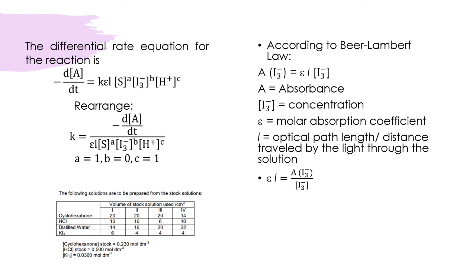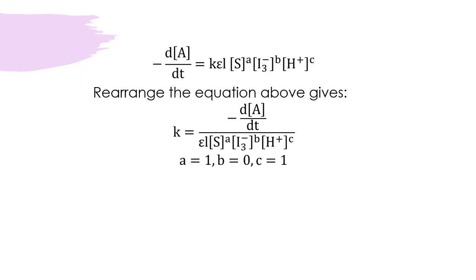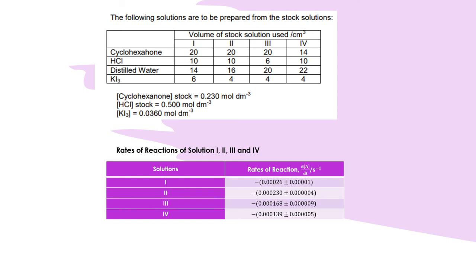So ultimately what you need to do is find the average of the rate. Okay, you're not asked to do that because we don't have the data here, but your assignment for this lab, just to remind you again, is to explain how this is related to the volumes that are being used here.